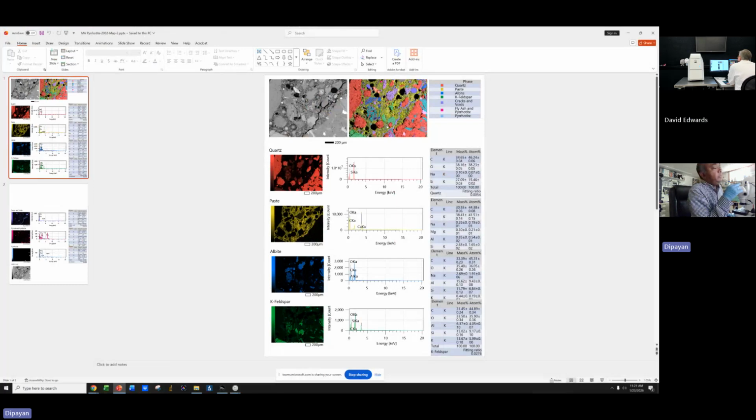So when you said you choose your elements in different colors, I think it's a long process for me to figure out which element, because they are highly influenced by what others are present. So maybe for me, staying in the auto mode is the good option for now until I am absolutely sure my paste yellow is fine. It really stands up nicely. So we'll see what other options I can play with there.